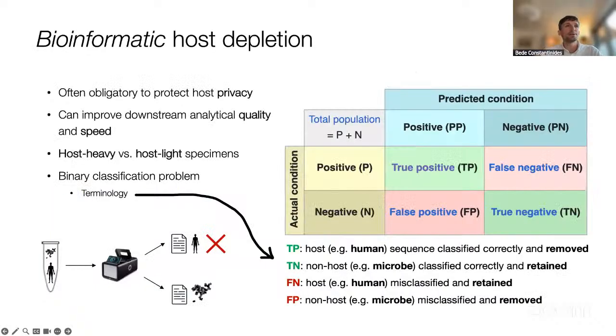So let's rewind. What do we mean by bioinformatic host depletion? We're talking here about removing sequences belonging to a host genome in which we are not interested. We want to discard sequences belonging to the host organism. When we try to DNA sequence microbes living on or in a host organism for research, diagnostics, or whatever, our DNA libraries inevitably contain some proportion of host sequences. And often that host is human, but certainly not always. We might be studying microbes of mice or of plants and so on.